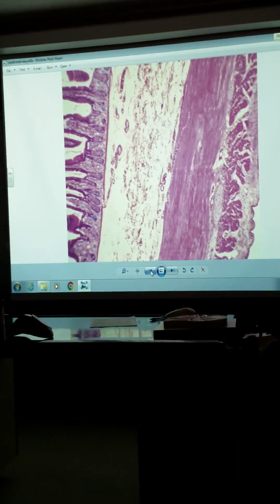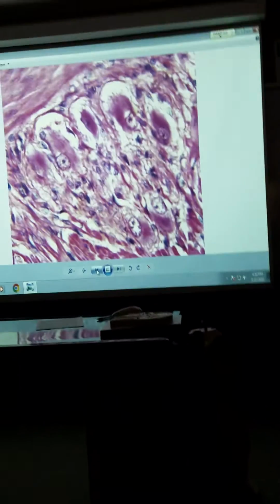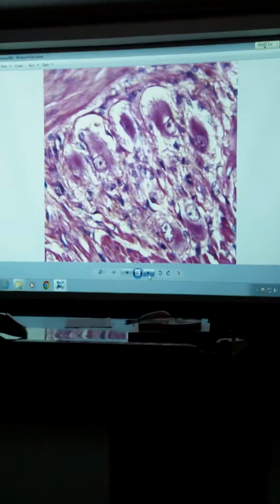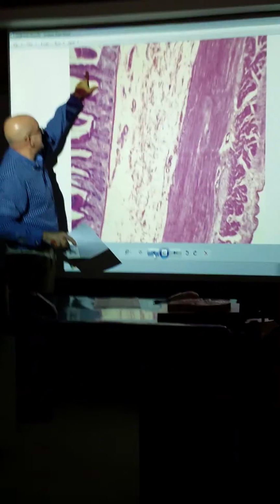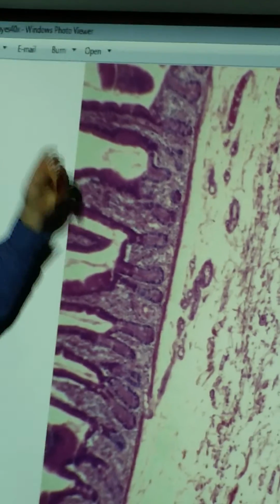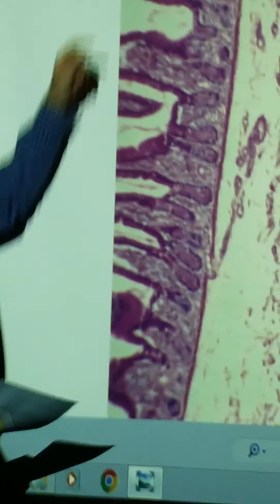Well, cross off lacteals. I saw one, but you ain't gonna think it's anything. I might as well just show you what I saw, and you won't think it's anything. You'll be glad you crossed it off. That little thread right there is actually a lacteal. What happens is these lacteals run up into my villi, and when I absorb fats, they go into the lymph first. Fats go into the lymph before they go into the blood. All the rest of the stuff goes into the blood. There's a lacteal right there.